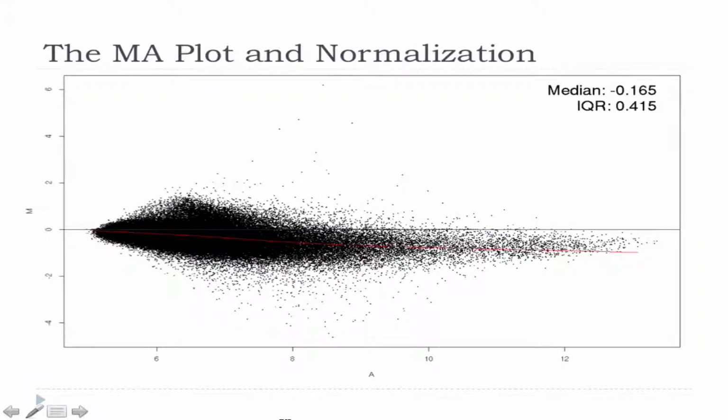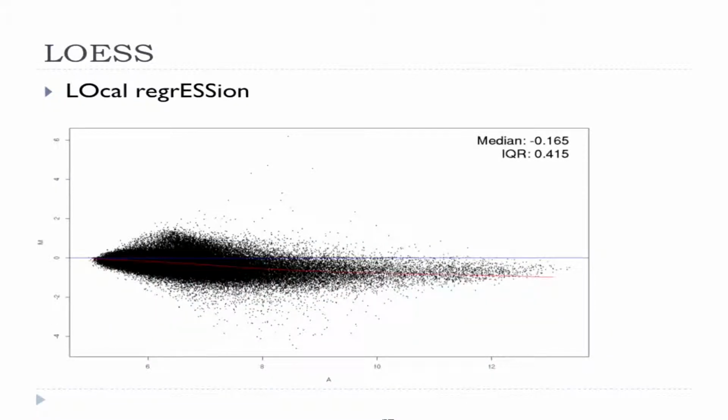So in terms of an MA plot, essentially what we're going to be doing is choosing a subset of the probes here that have the same rank, that didn't change expression. And then we're going to use a moving median across here, and then we're going to subtract that out. Okay. Another technique called LOESS, local regression, which is basically just a very robust way of fitting a function to the points in this cloud, and then we can use that to subtract out and again shift them all toward our M value of 0. I just want you guys to know what these things are, and you're going to be applying some of them this afternoon. There are many others, and I'm not going to try to touch on them all.